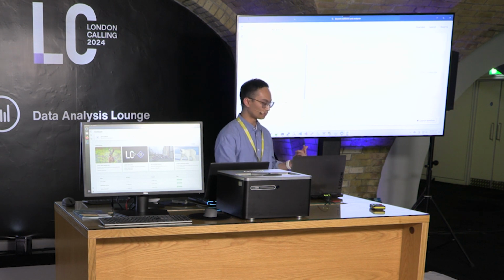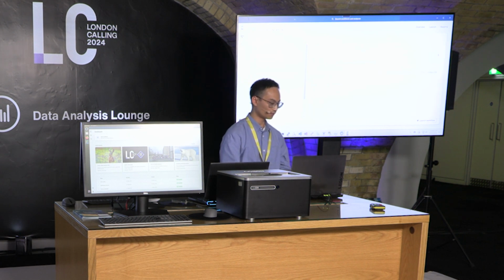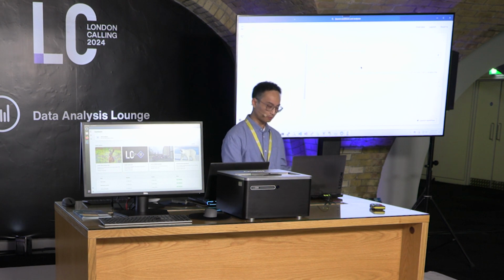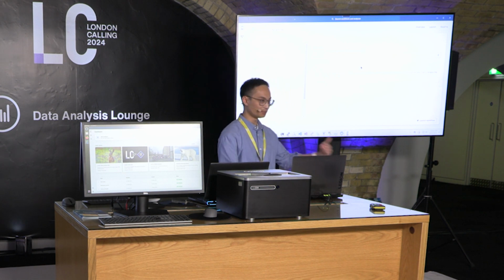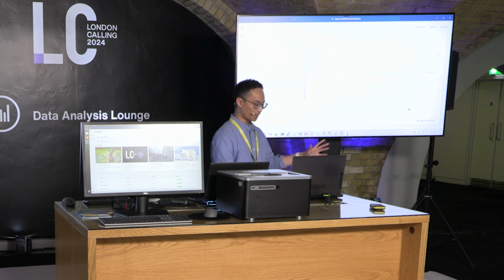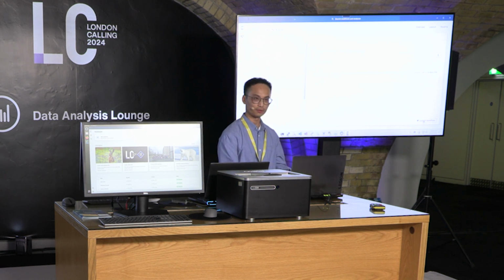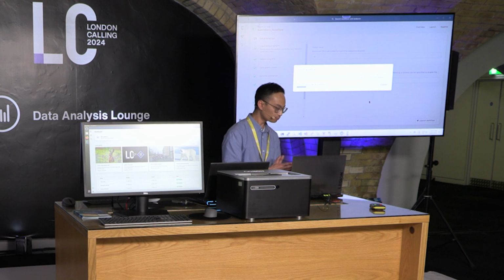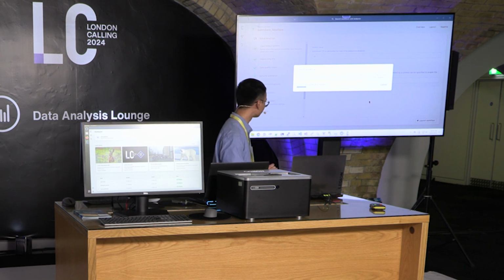And then I'm just going to skip over to the real-time options and increase the number of CPUs allocated to this run. Normally, if you want to get that immediate feedback, I would highly recommend having at least 64 CPU cores for this analysis. And then once we're happy with all the settings, we can go ahead and launch the workflow. It's going to take a couple seconds for it to spin up, so let's wait for that.